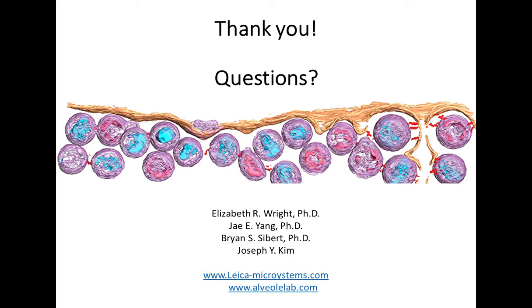Thank you, Brian. And this next question is for you, Joe. How can I be sure my micropatterns are aligned with the frame of the EM grid mesh?